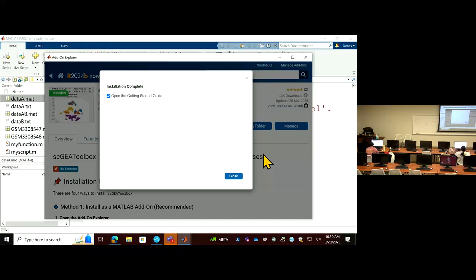I run a transport. It still pops up. Can I try installing it in a different folder? Can you just shut this down and restart, and then it's like a clean start?